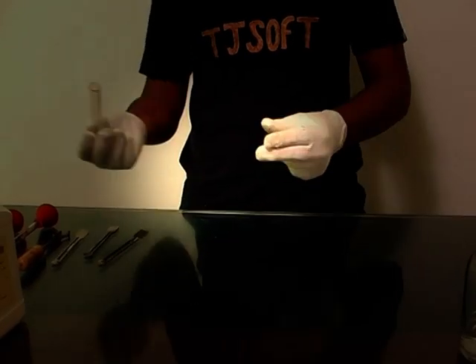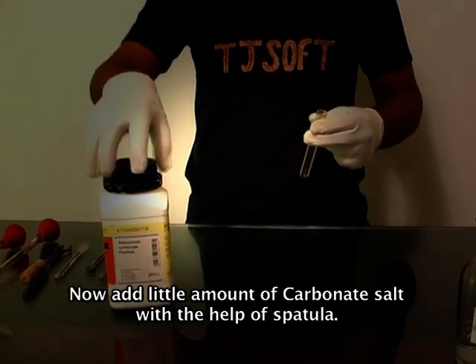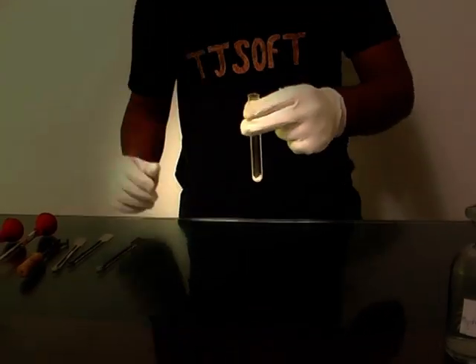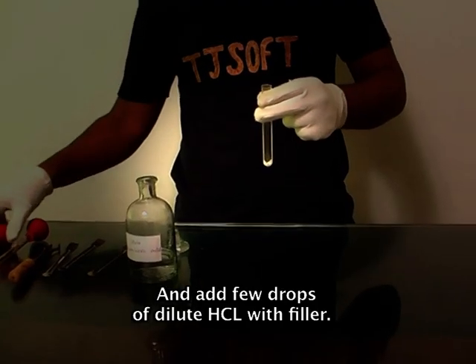Take a clean test tube. Now add a small amount of carbonate salt with the help of a spatula. Then add a few drops of dilute HCl with a filler.